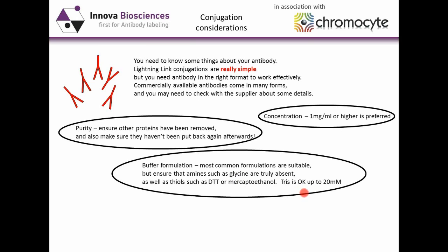Tris is actually okay in your buffers up to the level of around about 20 millimolars. So if you have Tris in your buffers at low level, that's probably not going to be an issue.